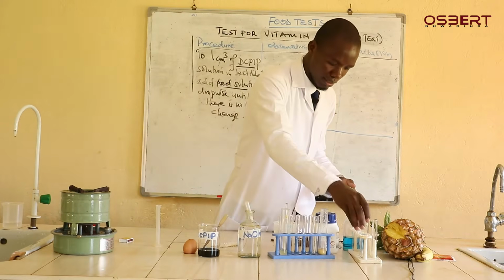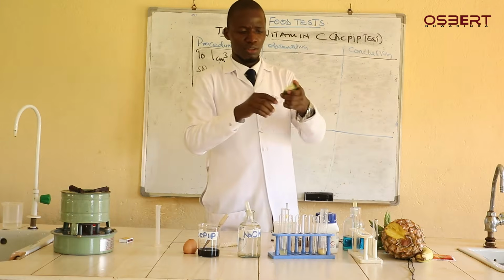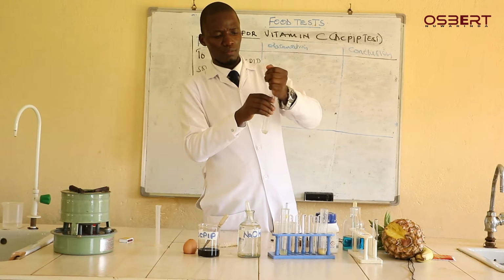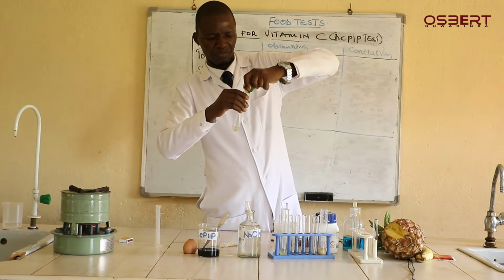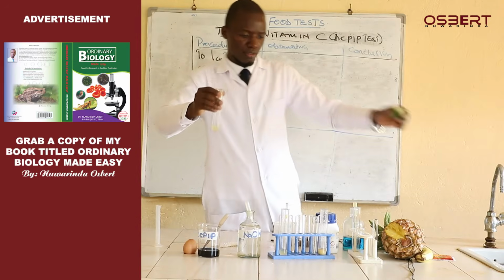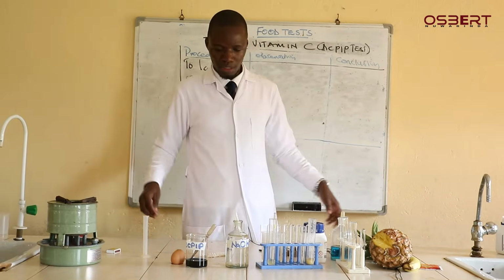So when I open this, and then I squeeze out the juice which is in there, and then we carry out the test on it. I expect to find a lot of vitamin C here. Yeah, so this is the juice from lemon. I'm going to put this side for it. So this is lemon, this is yellow banana, and then this is pineapple. We are going to carry out the test on them.